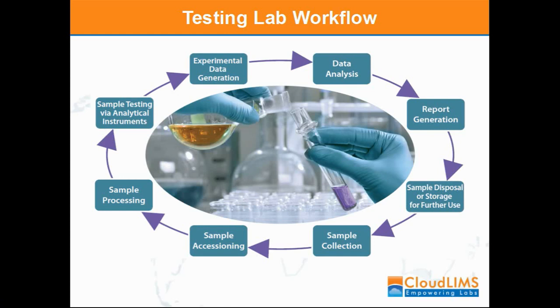A testing lab involves multiple operational steps, starting from sample collection. The next step would be data capture or sample accessioning. The data captured helps technicians track the samples as they are passed on to different custodians in the workflow.